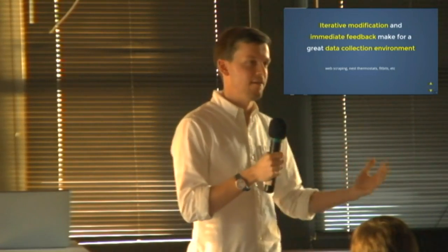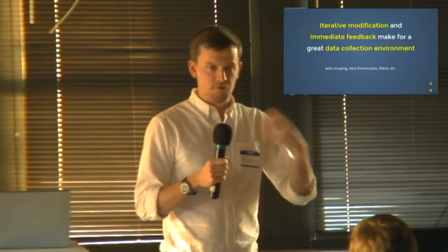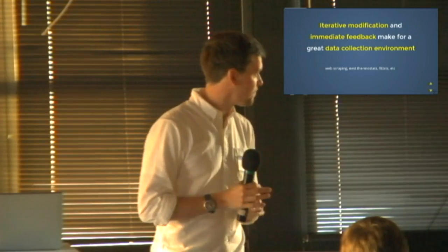You just write up a little Python module that talks to whatever you're trying to get data at, and then with the interactivity and the feedback of the notebook, you can really quickly get a good idea of how to collect the data that you want to collect.